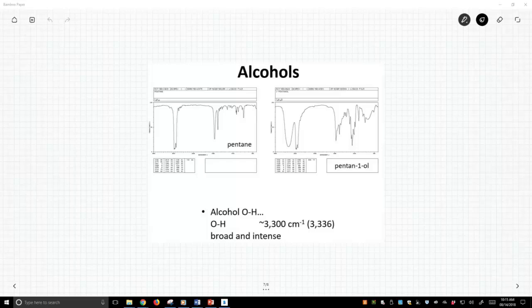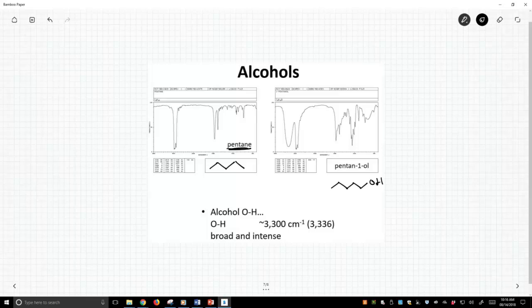So on the left-hand side of the slide, we have pentane, and then over on the right, we have pentanol. So we've seen pentane now many times. It's a typical alkane hydrocarbon just to the right of 3,000, just below 3,000 wave numbers. We have this nice strong peak.